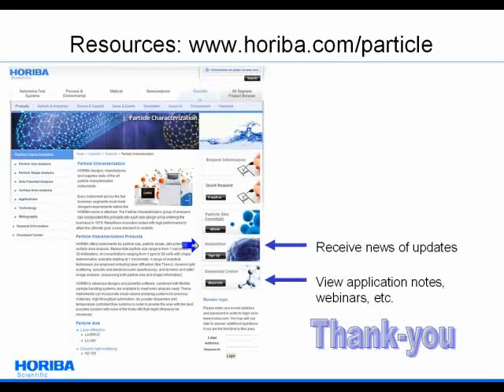All right, so first question comes from Susan. She asks, how can you measure particle-sized droplets of very viscous or very concentrated products by process analytical technology? Yeah, so PAT usually implies this is data that's going to be used to track the process of the manufacture of these delivery vehicles or the end product. At the beginning, I used to think PAT always meant inline measurements, and that really isn't true anymore. It's just which measurements can you use to track the process.